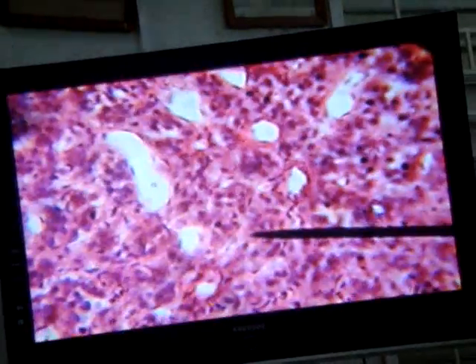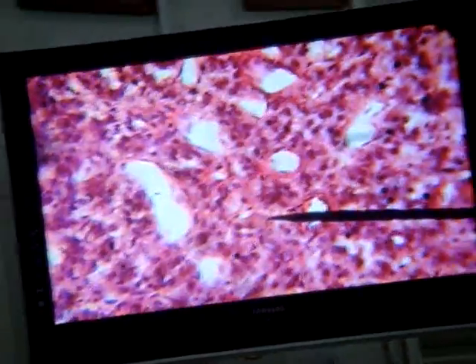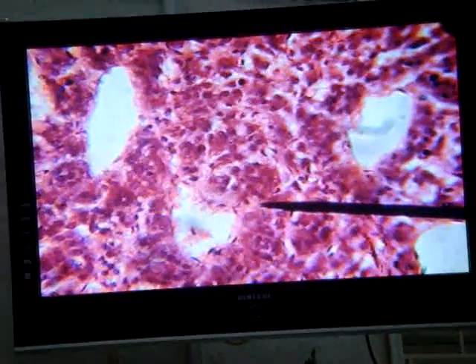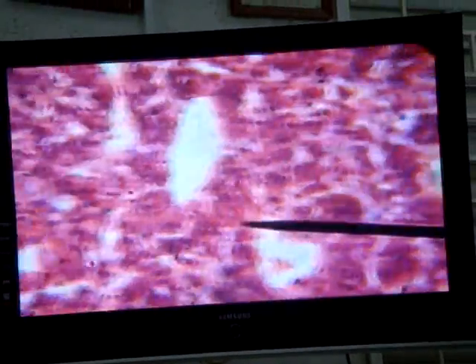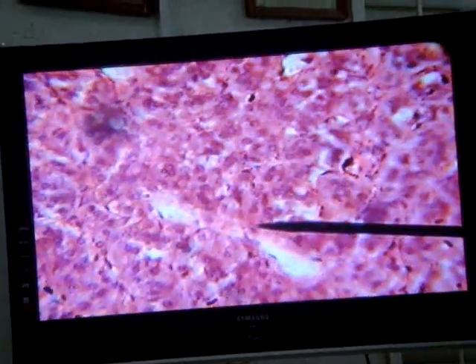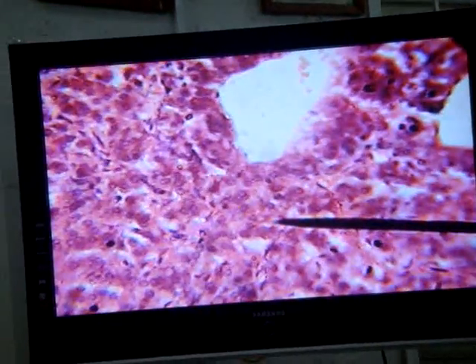Now, usually in the human subject and in some other animal subjects, the medullary vein shows a very thick tunica media, which is not the usual thing. Veins tend to have a thin tunica media, so the medullary vein tends to be much thicker than usual veins. And you will want to remind yourself of the embryological origin of the medulla as opposed to the cortex.